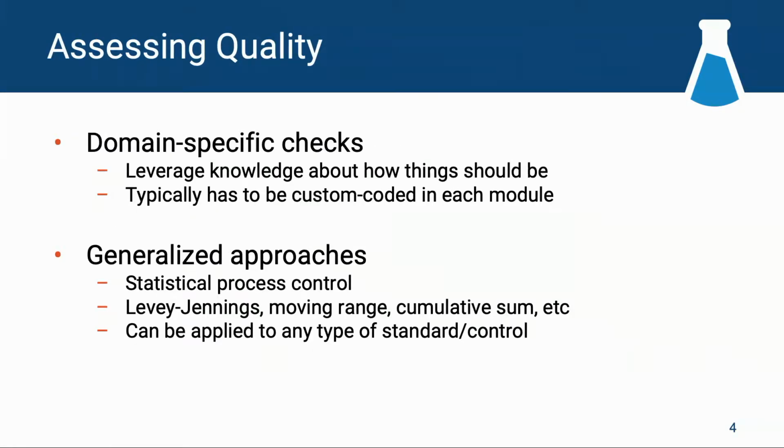Okay, so that's getting the data in. So imagine it makes it past our gatekeeping process, and that it's in the database, and we want to say, what's going on with this? So there's a lot of different ways you might be trying to analyze and understand your data. And I've broken it into two different categories. So the first is what I'm calling domain-specific checks. So this is something where the report knows something about the data itself. It's not a general purpose approach that we're trying to apply to any data that comes in.